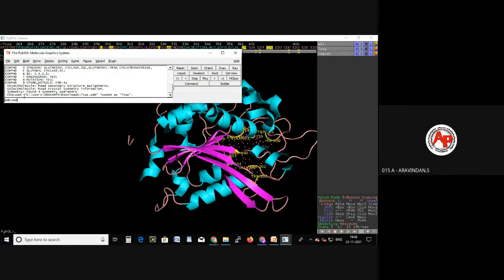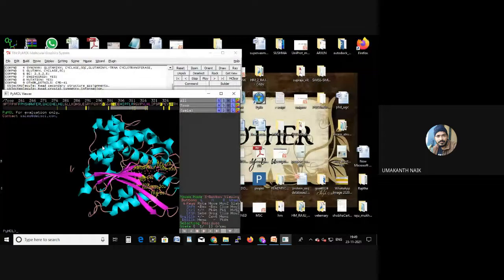Sir, where are you going to open that dialog box? Your voice is not clear. Can you talk to me once again? Is it audible, sir? That dialog box, how did you open it, sir? It will be opened automatically when you open PyMOL itself. See, both will be there when you open.